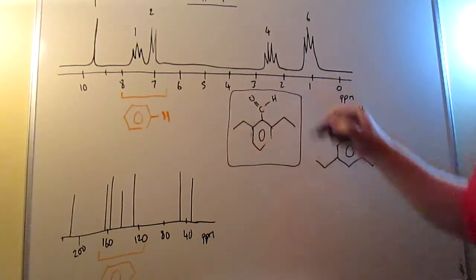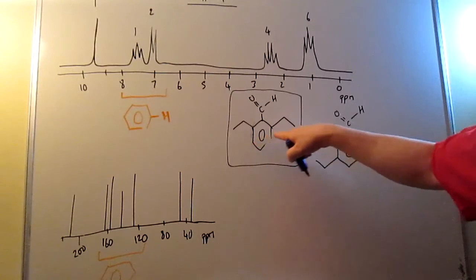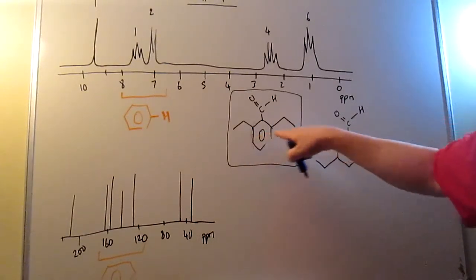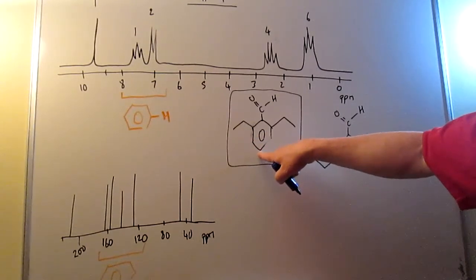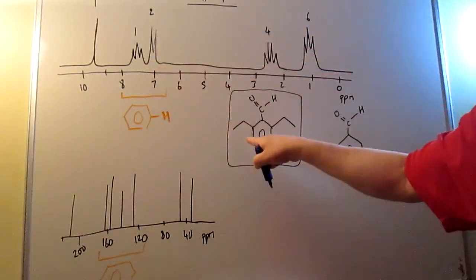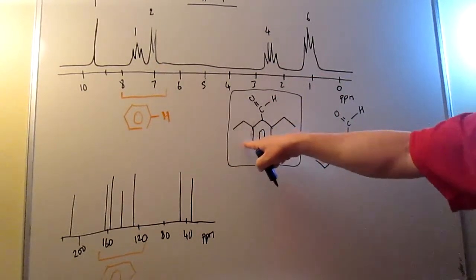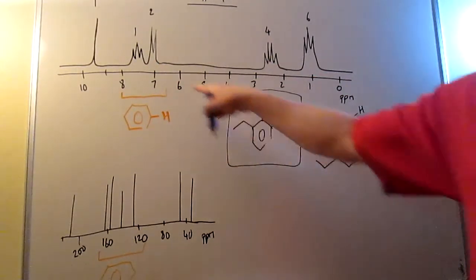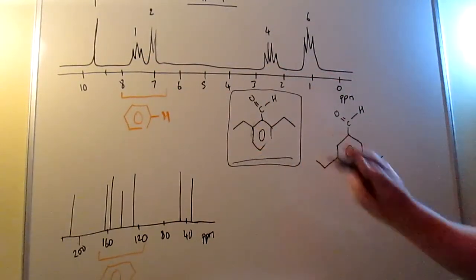Okay, and that fits with these two hydrogens being equivalent to each other, and they'd be split by this CH here, so that would give a doublet, so that peak comes from these two, and then this peak is split by both of these two equivalent CHs, so that gives a triplet, which accounts for that. So that is your structure.